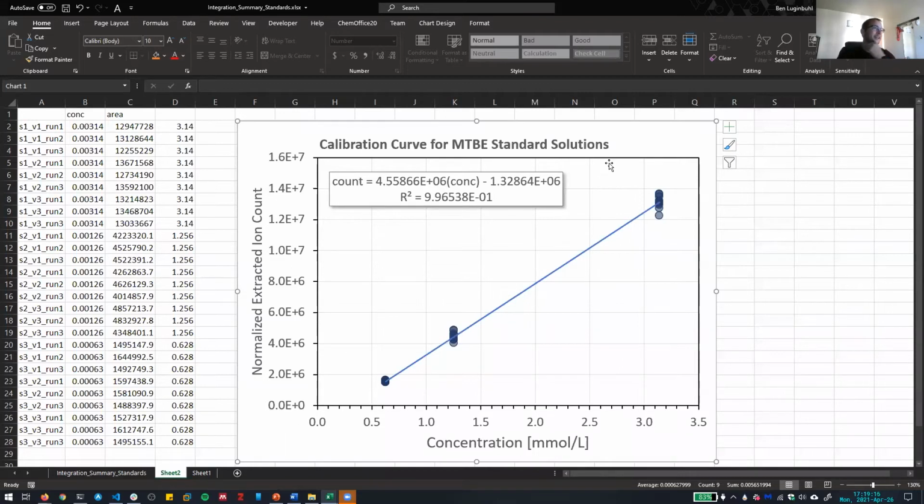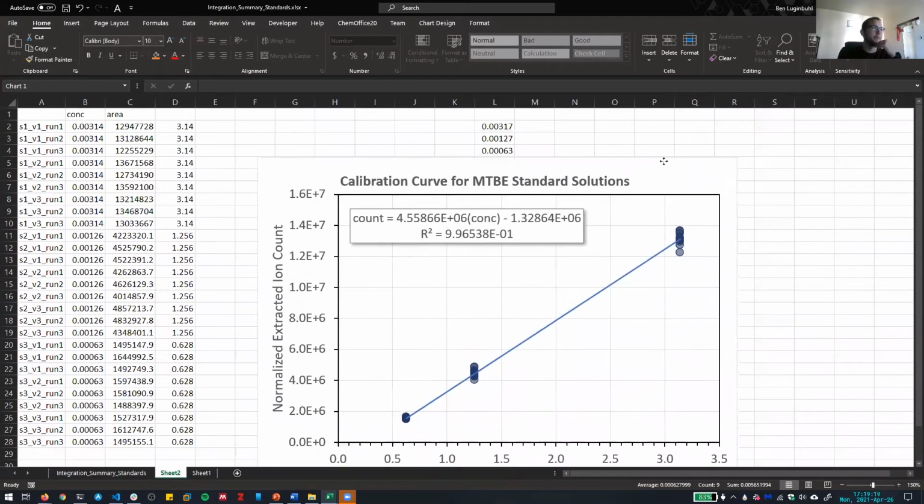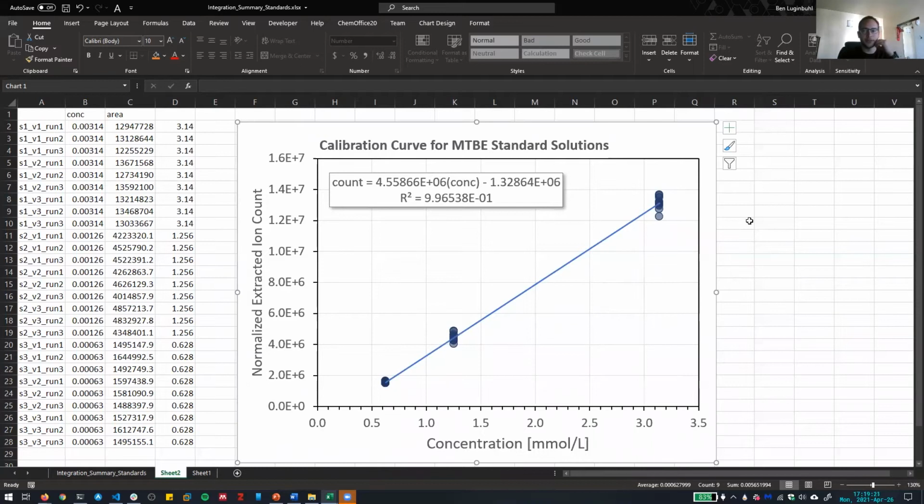Okay, at this point we can sit around together. What do you think? Do you want to split up into breakout rooms and work as lab groups, or stay together in this one room and work together to get these calibration curves done? Stay together, okay, because we can keep recording, so I can reference back to it later. Fair enough. That sounds good to me.